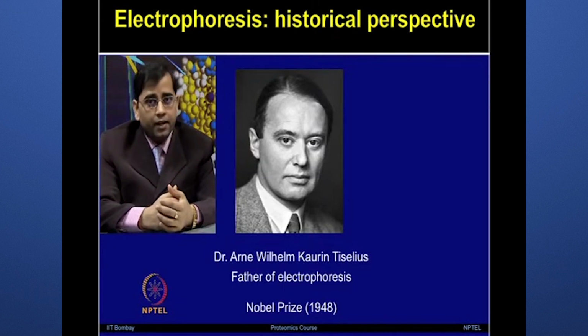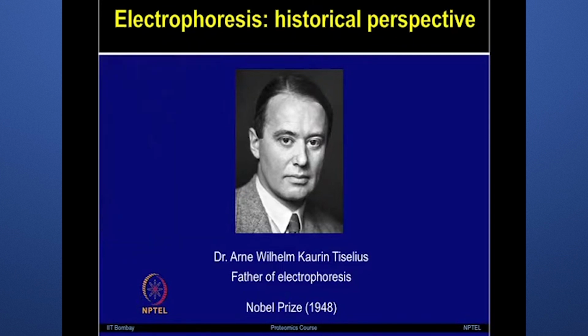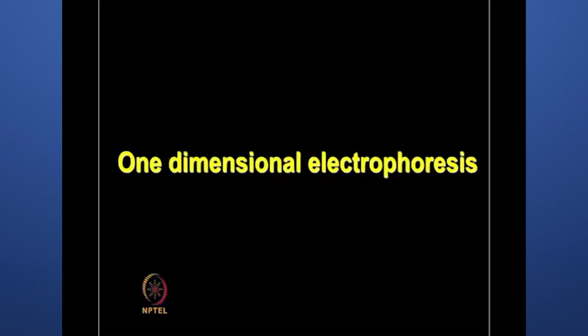For his great contribution in chemistry, he obtained the Nobel Prize in 1948. So, now we will describe one-dimensional electrophoresis, some of the concepts involved in that.